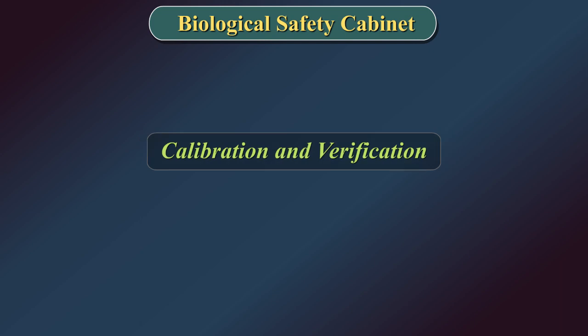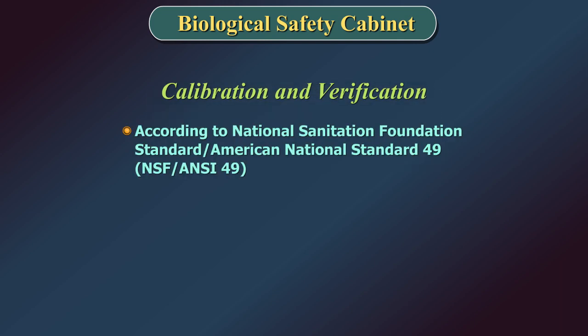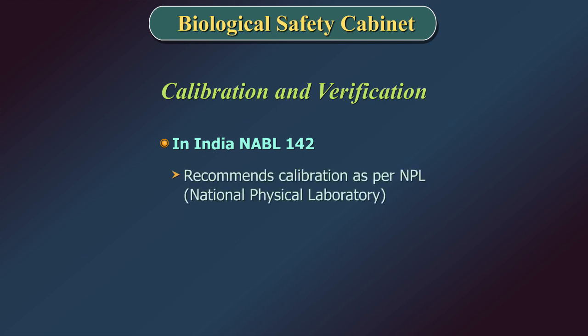Calibration and Verification: Biological safety cabinets must be certified at least annually according to the National Sanitation Foundation Standard and American National Standard 49, which is the accepted standard for the biological safety cabinet industry. In India, NABL 142 recommends calibration as per the National Physical Laboratory.